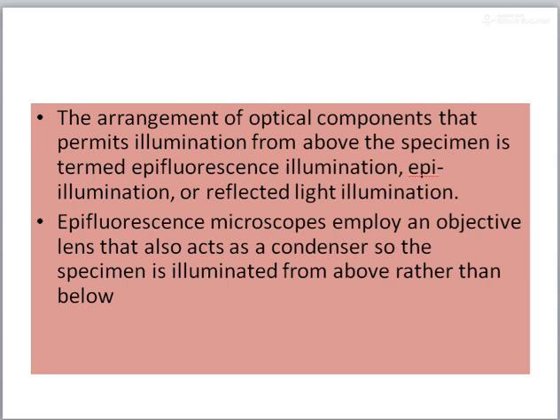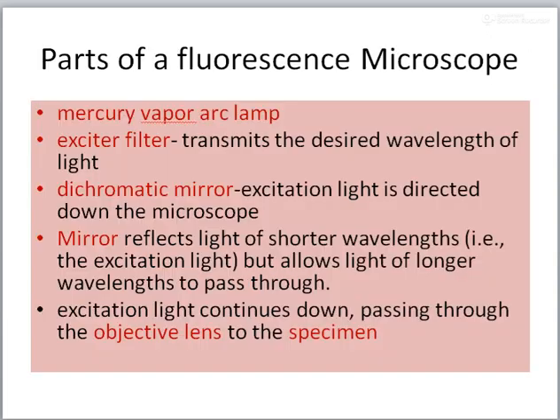And here, the objective lens, which can also act as a condenser, is being used, and the specimen is illuminated from above rather than from below. So that is the reason why we call fluorescence microscopy also epifluorescence microscopy.